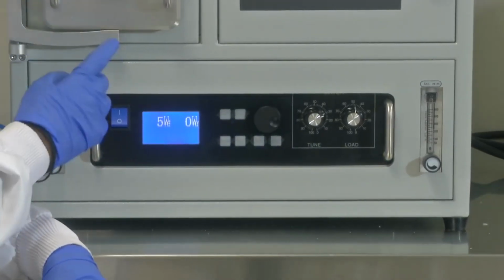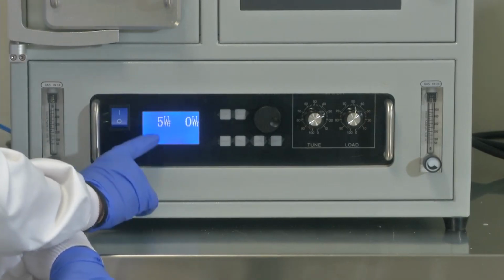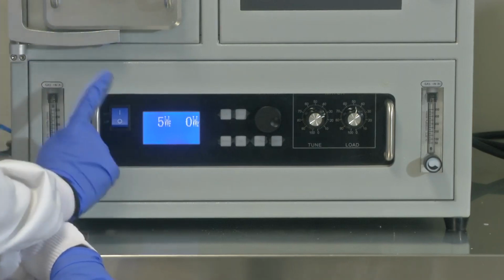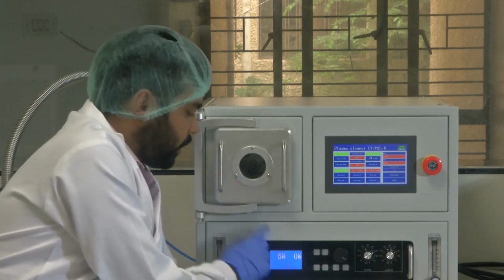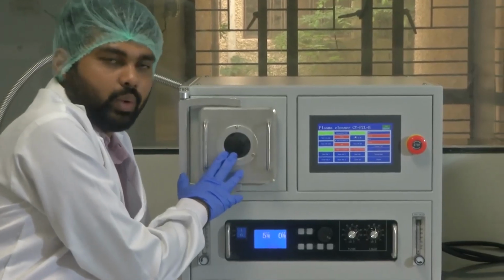So like this, I will keep increasing the RF power. Now let's look at the chamber where the fun happens. Let's zoom in on the chamber. Now RF power is 5 watt. You don't see anything special happening inside the chamber right now, correct?